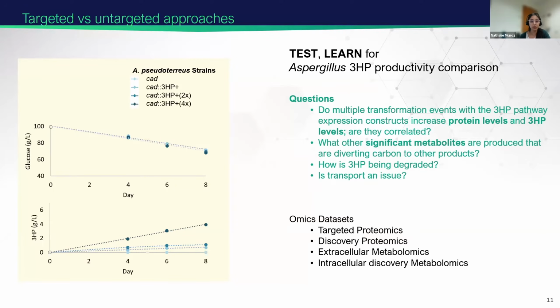So we collected all of these different omics data sets, targeted proteomics, discovery proteomics, and the same for metabolomics, intracellular and extracellular, to try to get a clear picture of what is going on inside and outside of the organism.